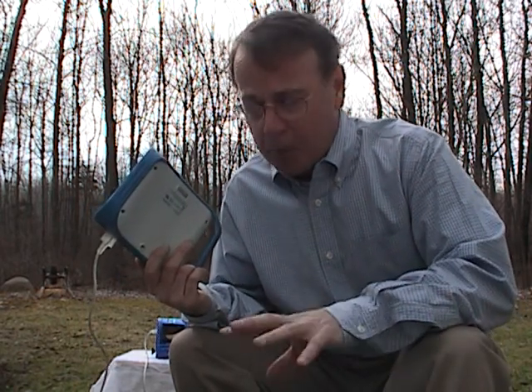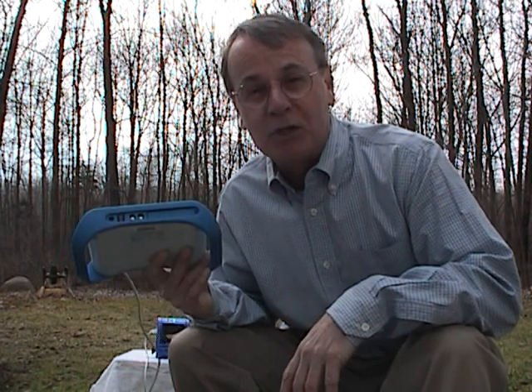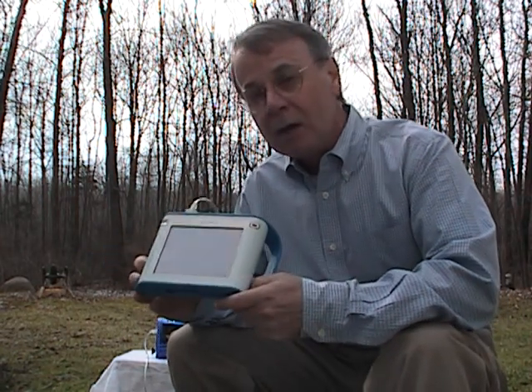It comes bundled as well. The base model is $329 and comes with the sensors I showed you and also an AC adapter to keep the battery going. But you can get physics, biology, chemistry, and earth science as a bundled unit. They're a little more expensive, but you might want to pay for those to get all the sensors you need. The earth science one actually has a soil sampling sensor, which is really cool and very useful, especially if you're doing science testing of students and want to find out more about what they know.